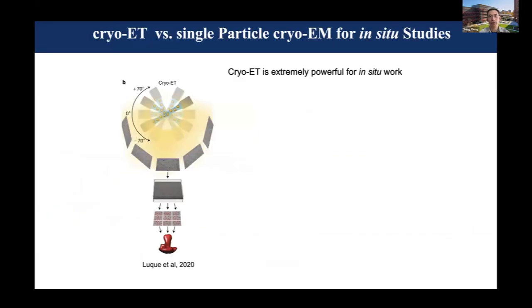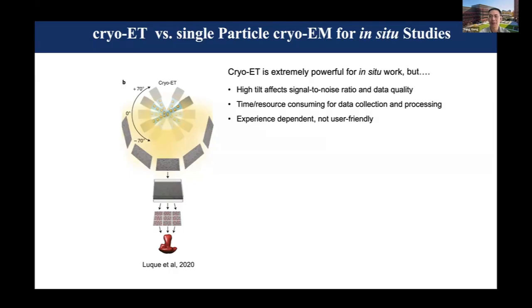Okay, that's the power of cryo-ET, as you already heard. But also, as Grant alluded to, or summarized at the end, cryo-ET is extremely powerful, but also extremely hard to do. There are some high-tilt intrinsic problems that have to be dealt with to get high data quality. The field is very actively working on that, but we don't have a good solution yet.